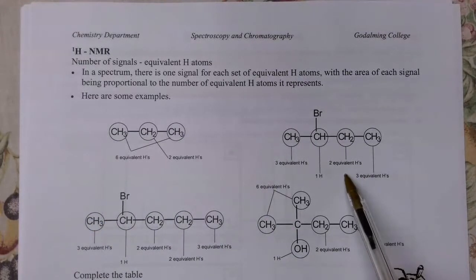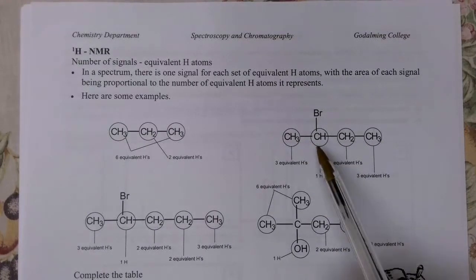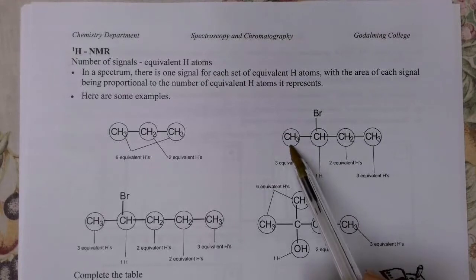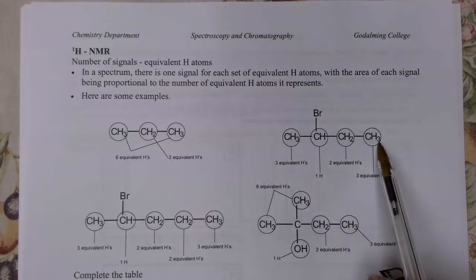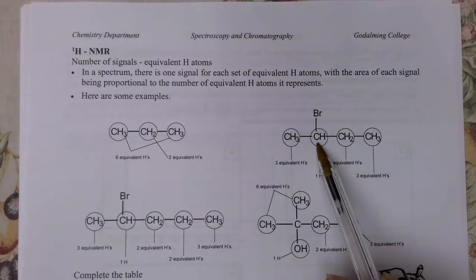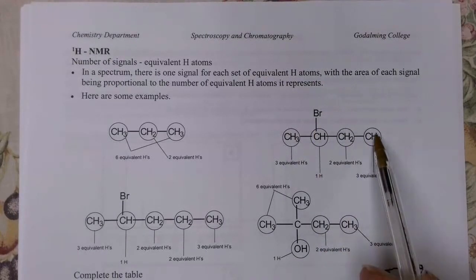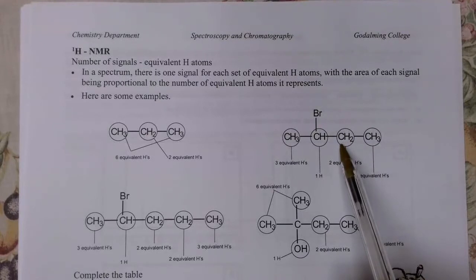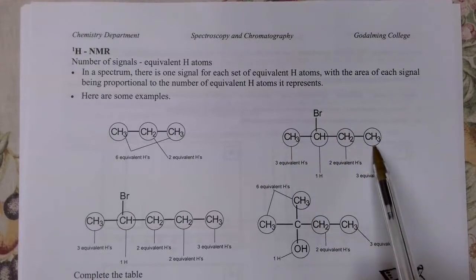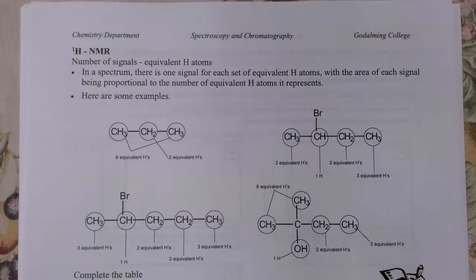Moving on to this example, each of these hydrogens is in a different environment. So we've got three hydrogens here in one environment. Now these are different from these three hydrogens. The reason that they are different is because these hydrogens are adjacent to this carbon here with a bromine on it. These hydrogens are adjacent to the next carbon along the chain, which has got two hydrogens on it. So these two are not in the same environment. So here I have 1, 2, 3, 4 different environments.